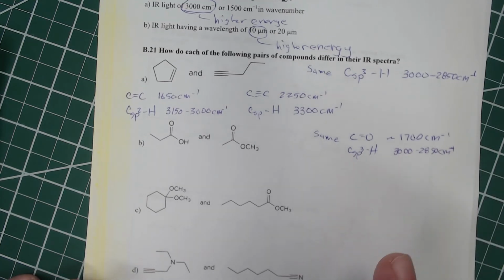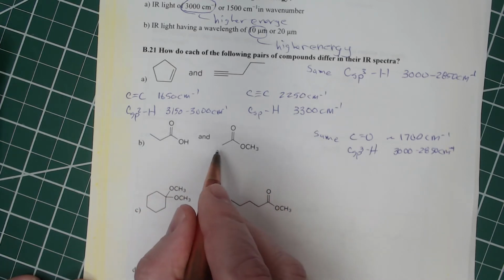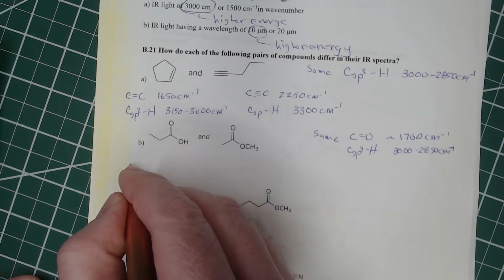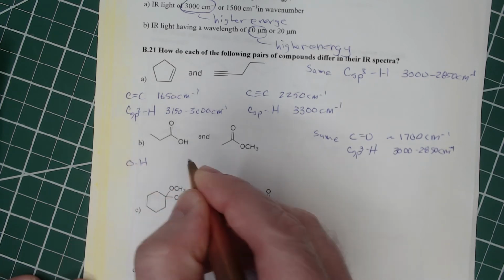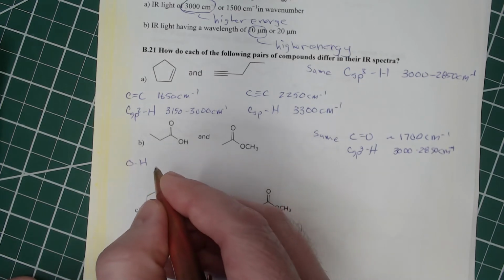Okay, now let's look at what is different. Well, there's really one big difference that's going to happen here because this has the OH. And the OH on a carboxylic acid is actually a little bit broader.